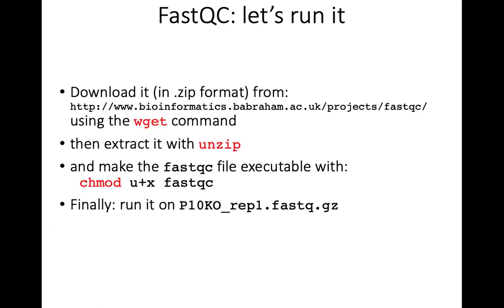So in your case, you don't have to do wget. I don't have to use wget? No, because you've already downloaded the file. Oh, wget is for web get, get from the web or whatever you want. And unzip is a bit like gzip, but for .zip files.